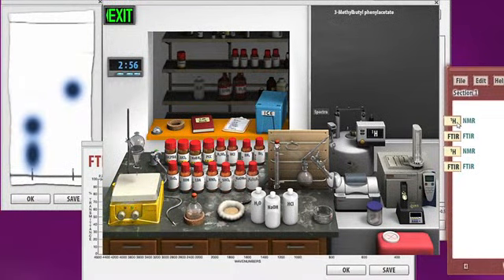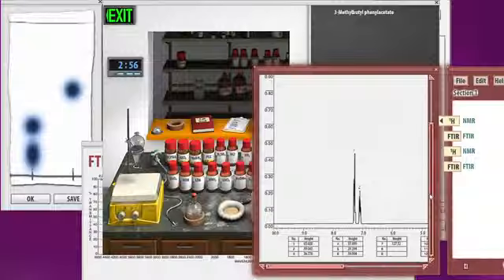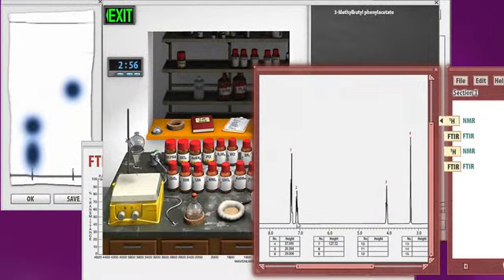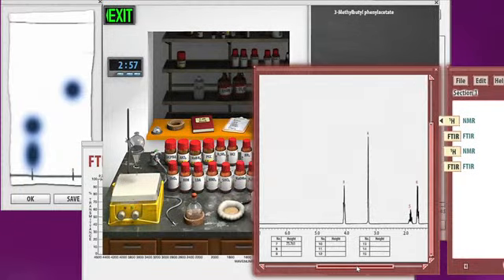What do we have? So this is what we had wanted to produce. You can see the spectra there, the different peaks. Okay, we can see the locations. We've got about a 7.5, close to 7, 4. Okay, let's pull up the one for the product that we created to see how well we did in our synthesis. It matches exactly. So we know we created the exact same compound that we had attempted to create.